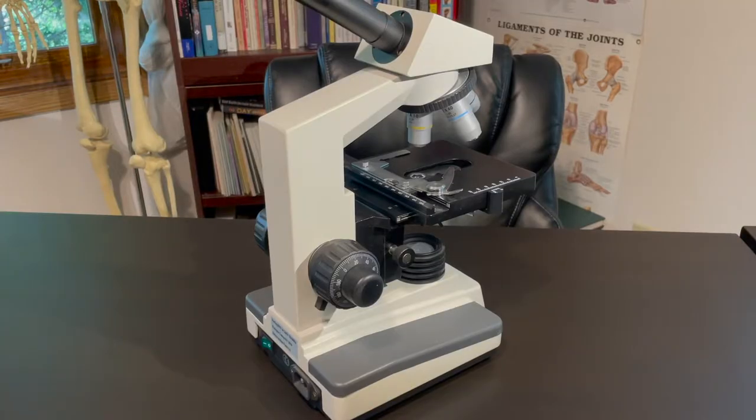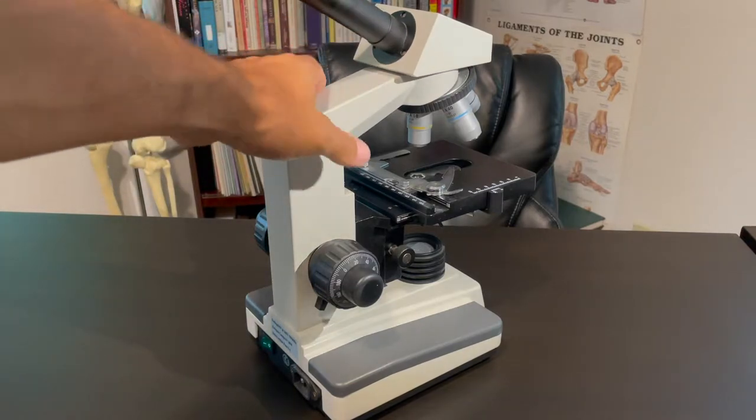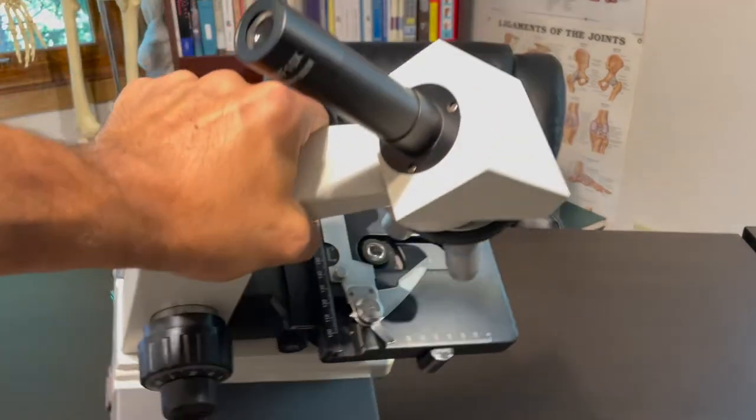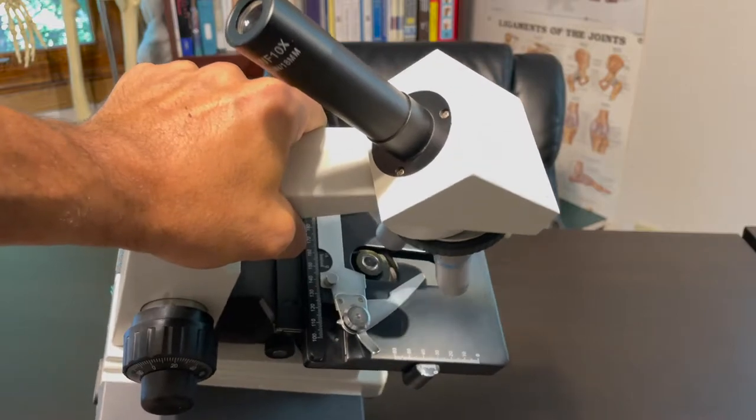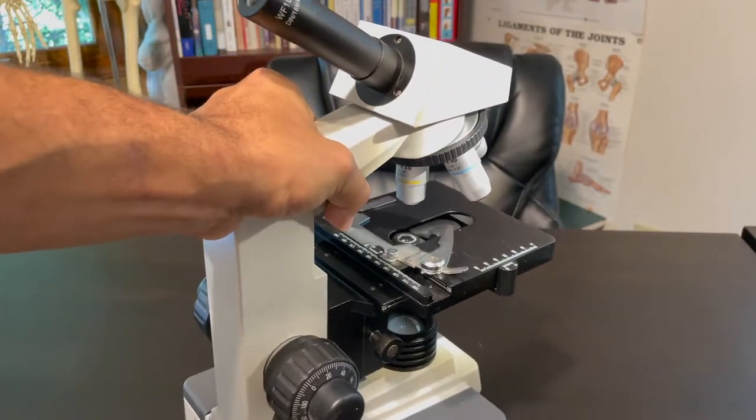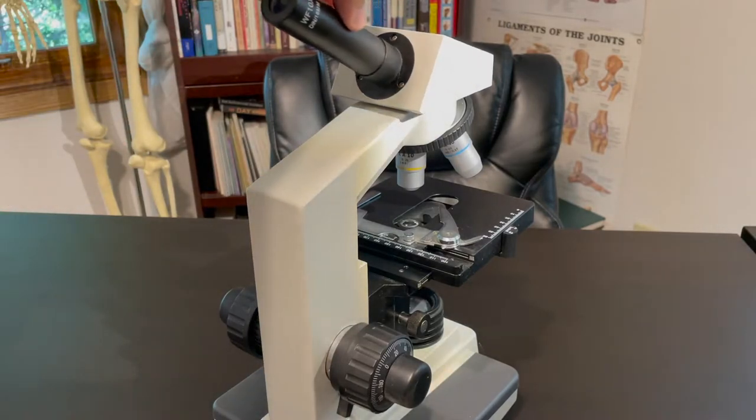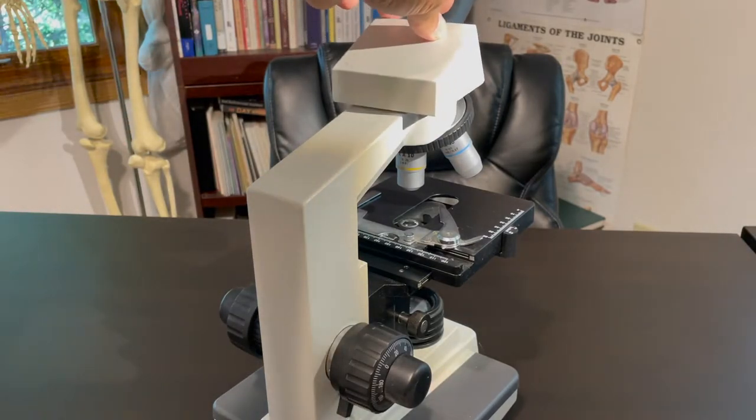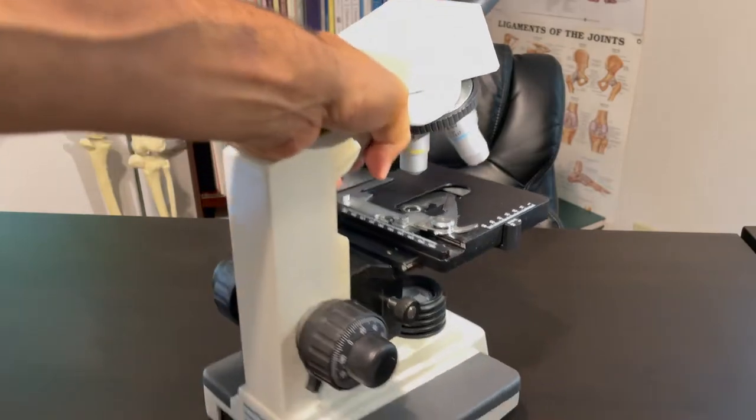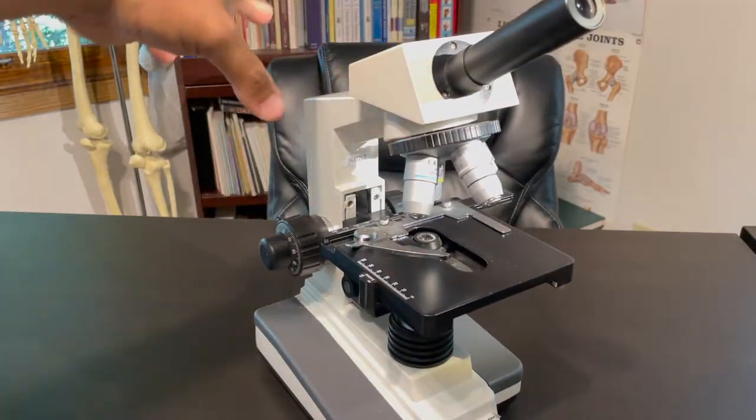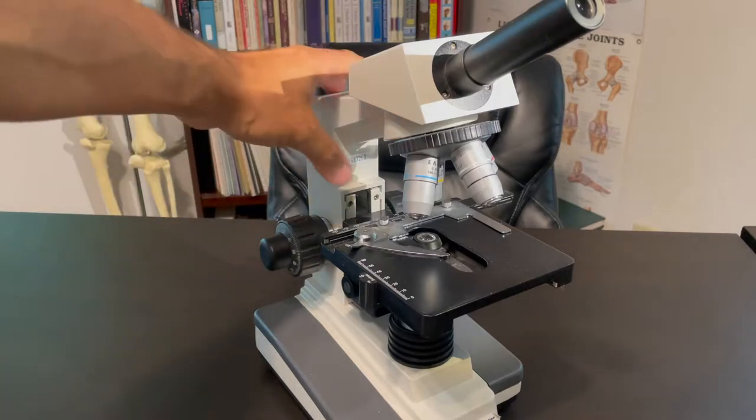Okay, so here we got the microscope. This is a monocular microscope because you look through it using one eye rather than a binocular microscope. You can use it like this, or you can spin this around and use it like this. So this is how we'll do it just so we can see all the rest of the parts here.